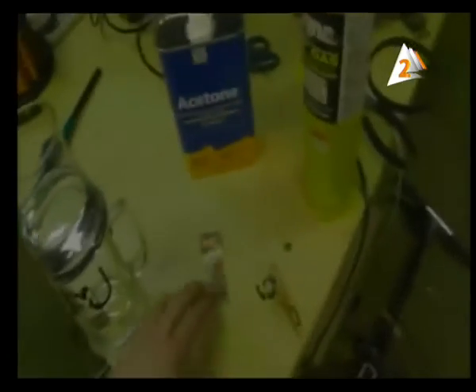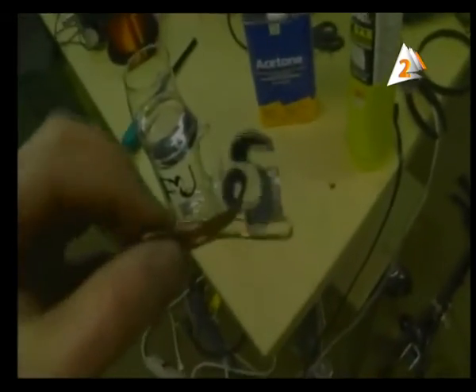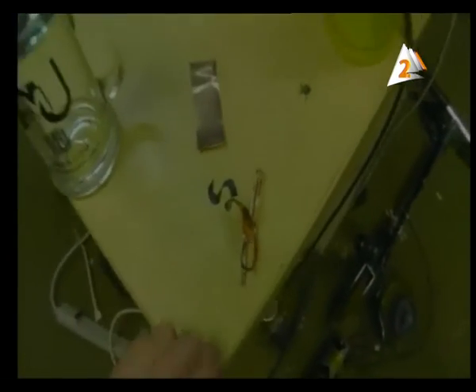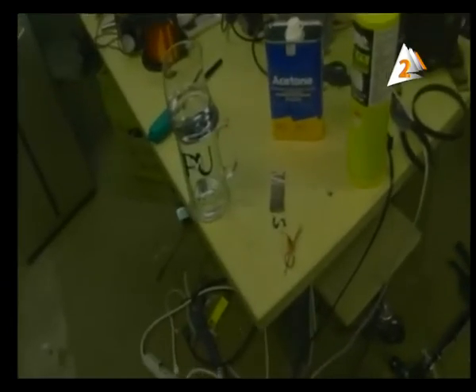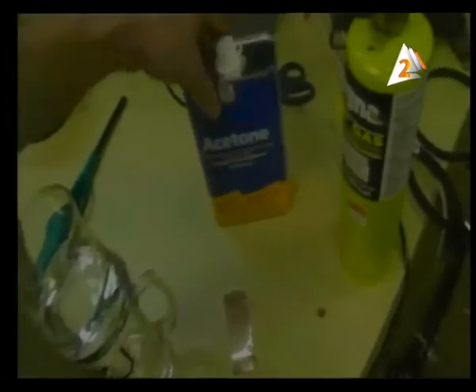Now, I want to know what is the effect of this catalyst. Bring a piece of the copper and give it this shape as you see. We use copper here. Why do we use it as a strip, or what? It is the coiled one, or the zigzagged one, to increase the surface area of the reaction. Good. And we can say we use it as a catalyst.